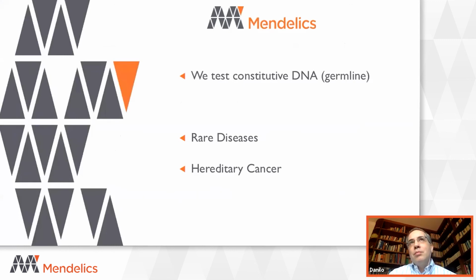And Mendelics, well, just a few words. We are one of the major labs in Latin America, based in Latin America. And what we do is we test constitutive DNA. So we don't do tumor testing. We test for rare disease, we test for hereditary cancer.